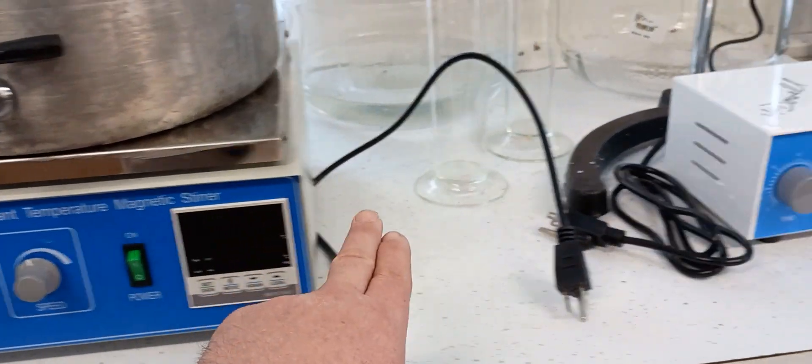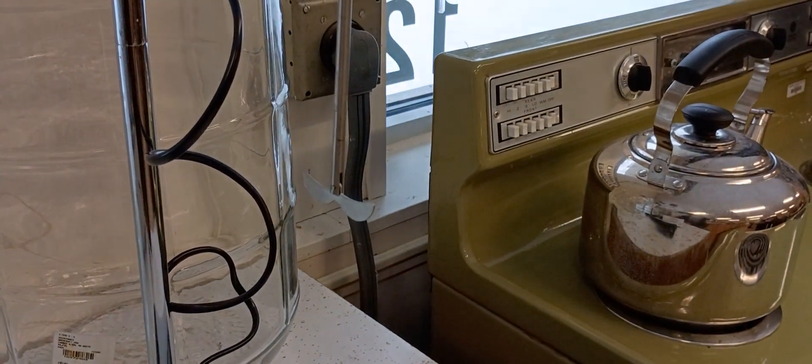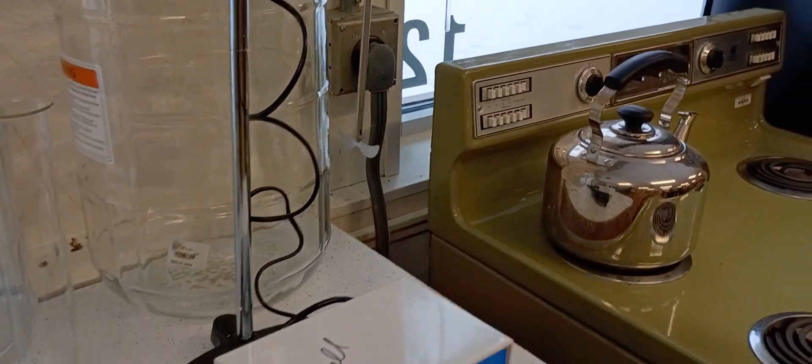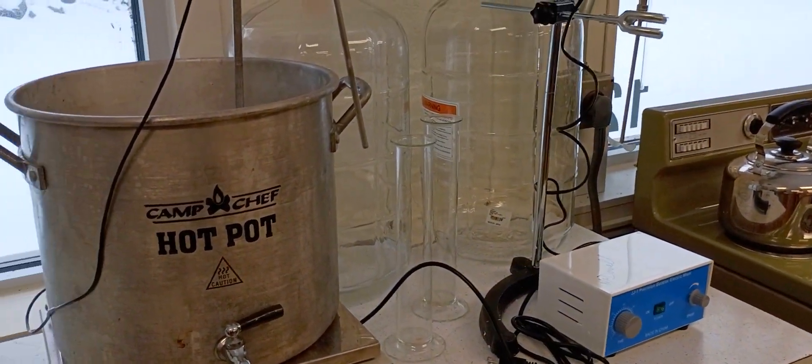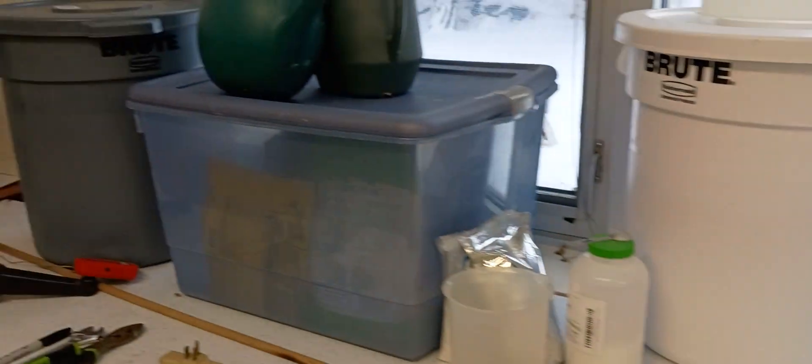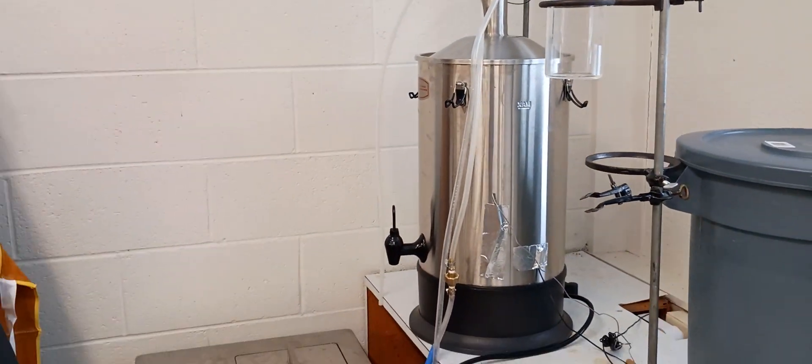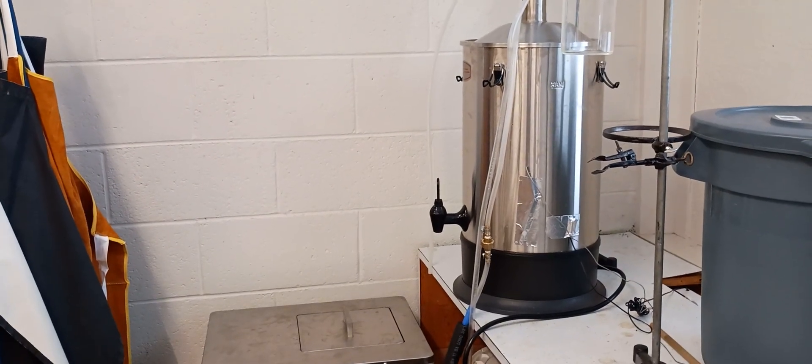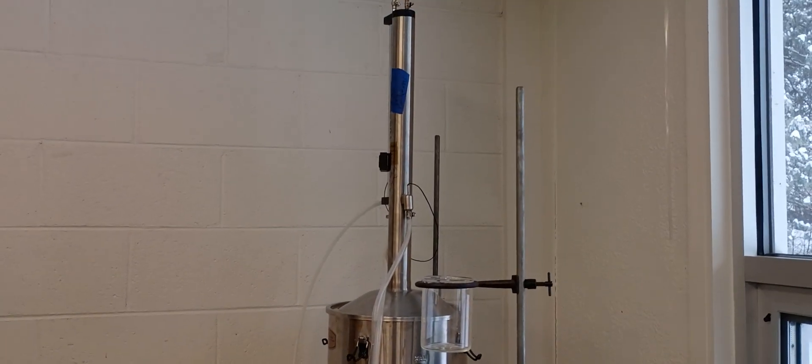We have our large hot plate here with also a magnetic stirrer. So this one, the stirrer is on the bottom. This one, the stirrer goes in the top. You can see that blade there. If we have a material that's a little bit thicker and it's hard for that magnetic stir bar to get going, we'll use the stirrer for the top. And then back here again is our whole distillation column, our chiller and our still. There's the column right there.